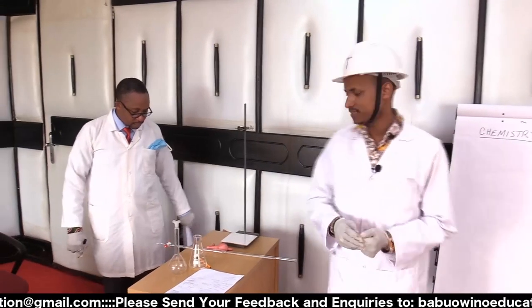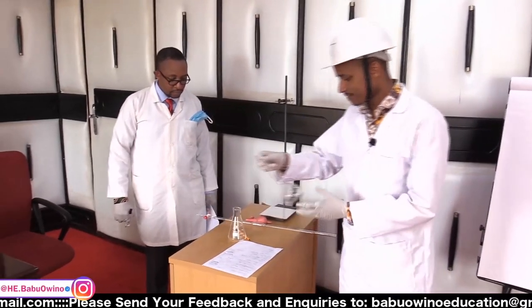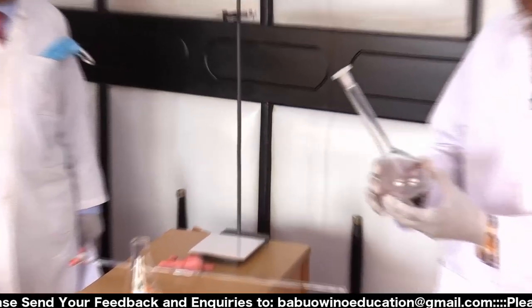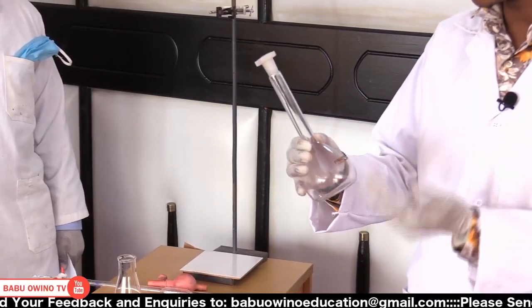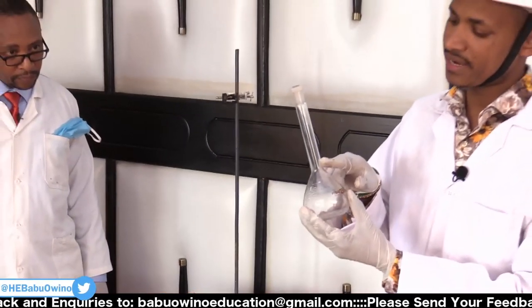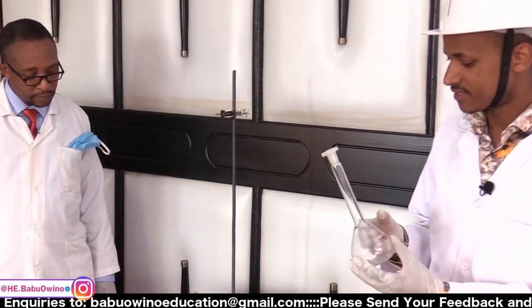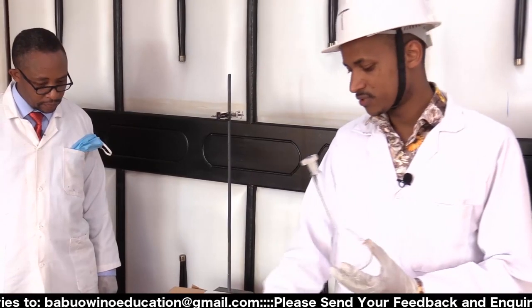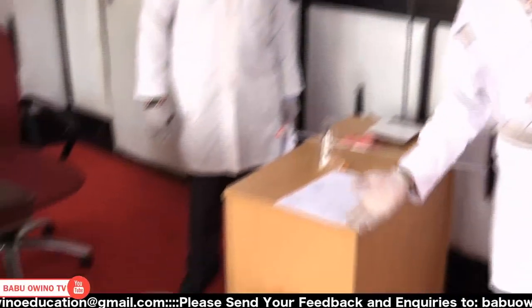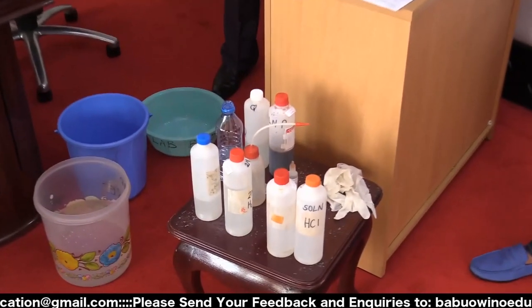The first apparatus that we have here is a volumetric flask. The volumetric flask is where we mix our solution and measure 250 milliliters of the solution to where the mark is. After measuring, we put them in different containers. As you can see, we have various acids, we have various chemicals here.